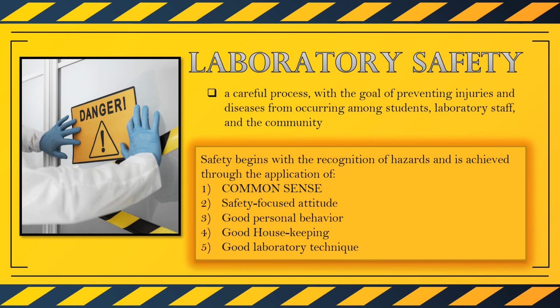So, class, when we say laboratory safety, it is not just a process but a careful process that basically aims to prevent the occurrence of injuries and diseases inflicting among students, laboratory staff, or medical technologists, and the patients as well. And take note, class, that safety begins with the recognition of hazards and is achieved through the application of, number one, and will always be, common sense. Why? There are several factors that actually justify it.